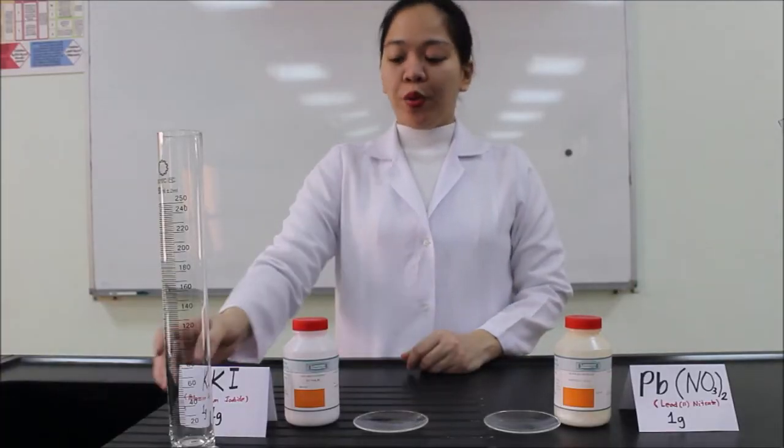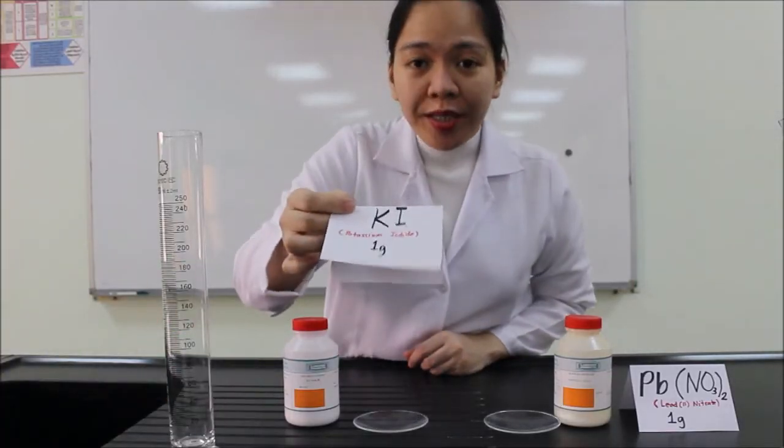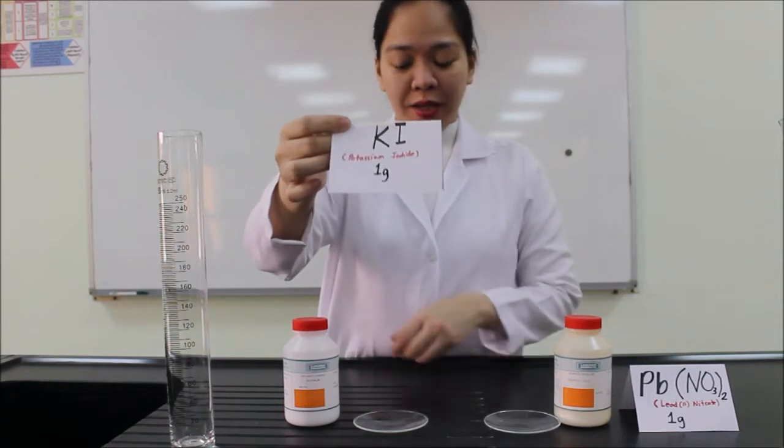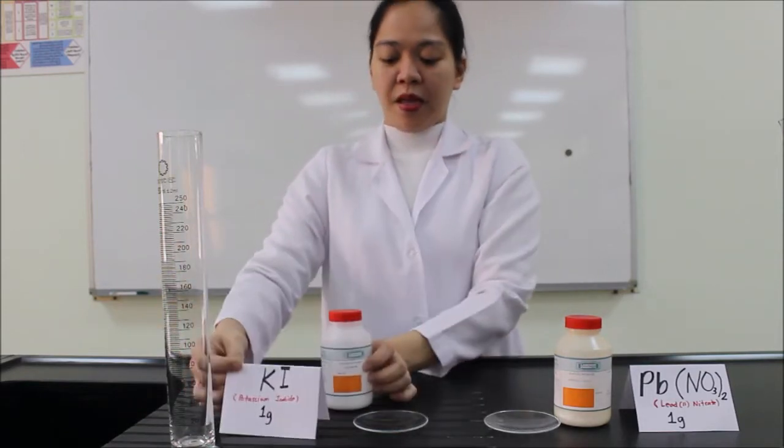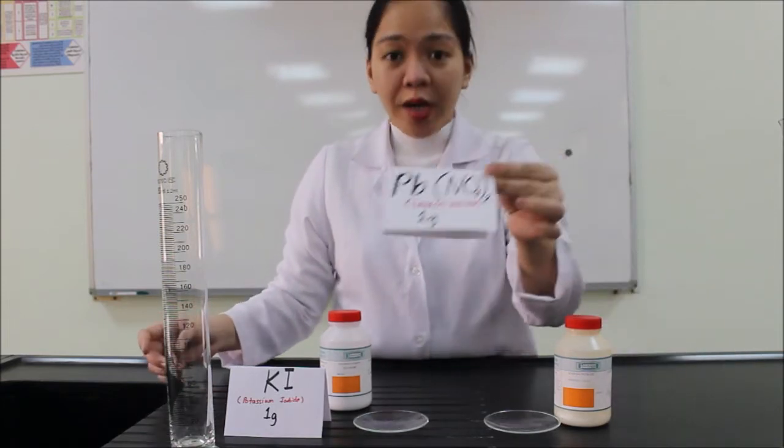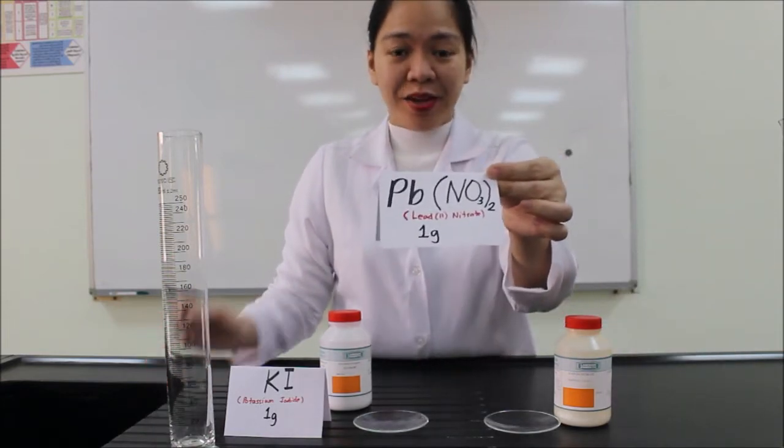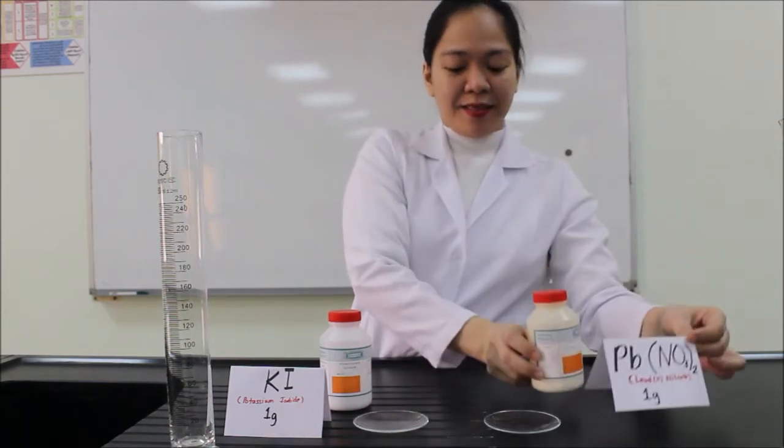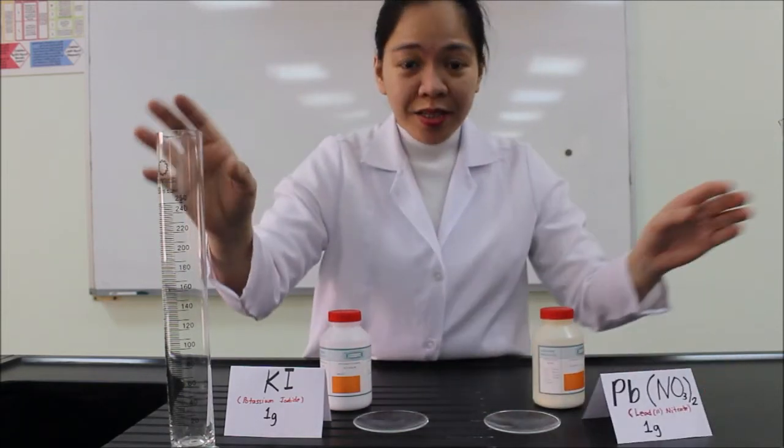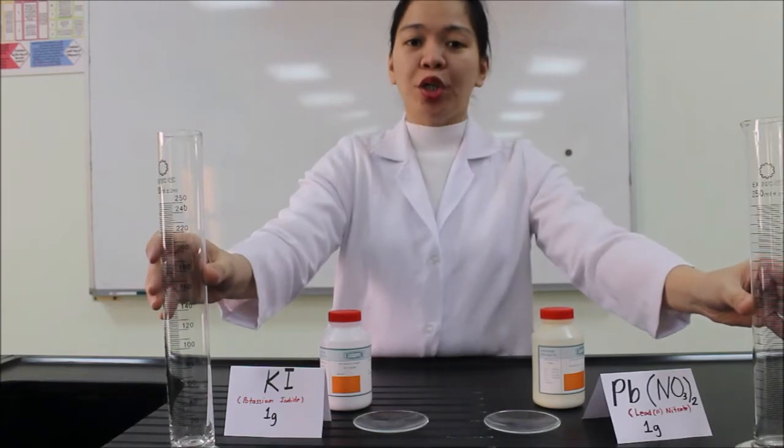Today I will show you the golden rain experiment. In this experiment, we will need 1 gram of potassium iodide, 1 gram of lead nitrate, and 175 ml water at room temperature.